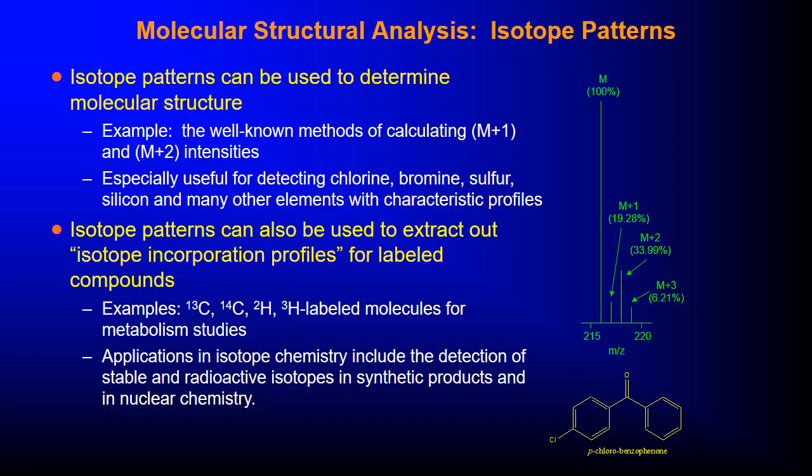Isotope patterns can also be used to extract isotope incorporation profiles for labeled compounds. For example, carbon-13, carbon-14, deuterium, and tritium labeled molecules for metabolism studies.